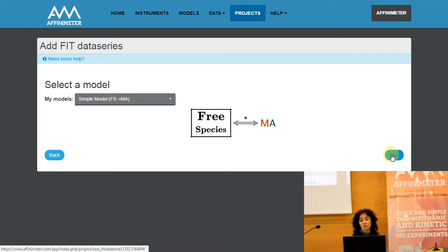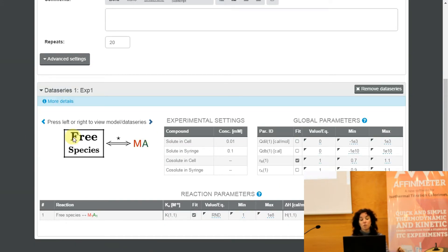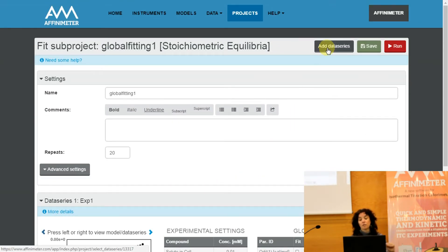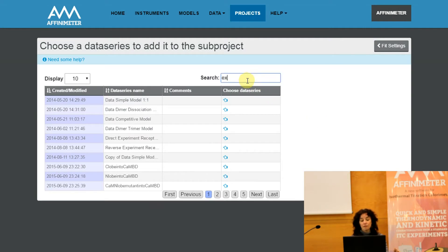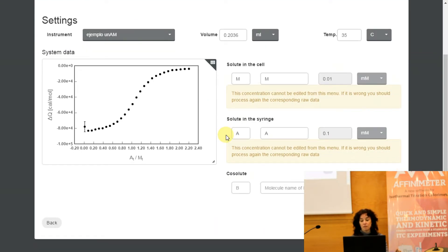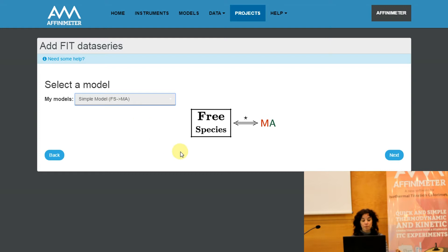By clicking on Next we will have the first isotherm included in our binding model. Next I'm going to include a second data series — a second isotherm. Click on Add Data Series and repeat the process: select the data series, click on Next, and select a model that is going to be used to fit that second isotherm. In this particular example I will also select the simple model that involves the formation of the one-to-one complex.